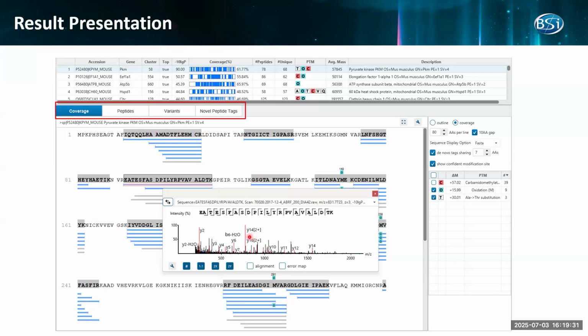Also you can see, with this coverage, there are peptide variants, even some novel peptides with a good sequence tag associated, like this gray bar showing there is a precursor. The sequence is not exactly matched to this one. However, by de novo, their sequence contains a tag that starts from here and matches this.